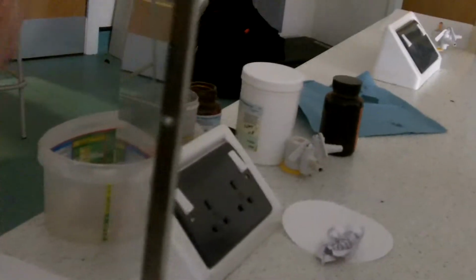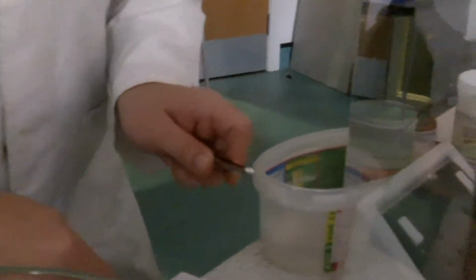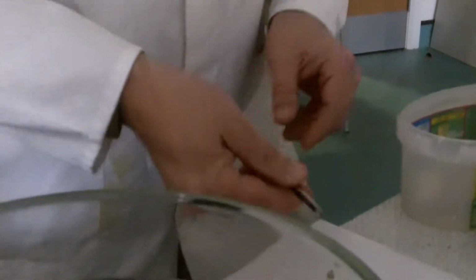Wouldn't there be cross-contamination by using the same water every time? No, they're fine. I'm just demonstrating the reaction with water. See again, it's a nice and shiny metal. I'm just showing you how reactive it is in water.